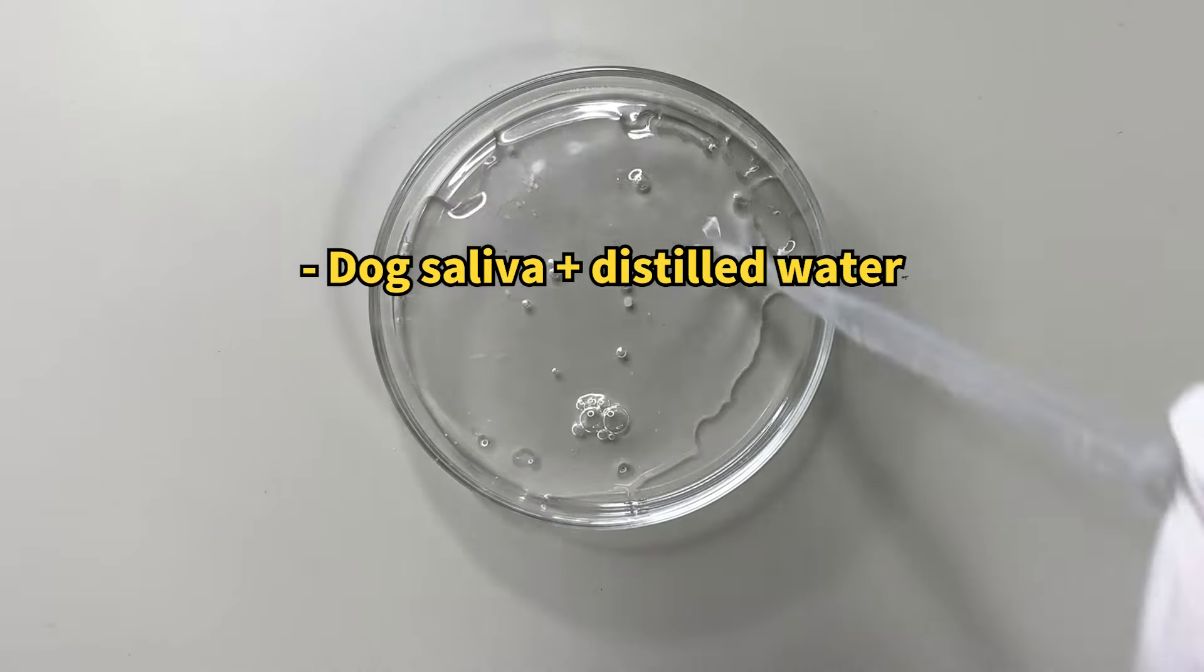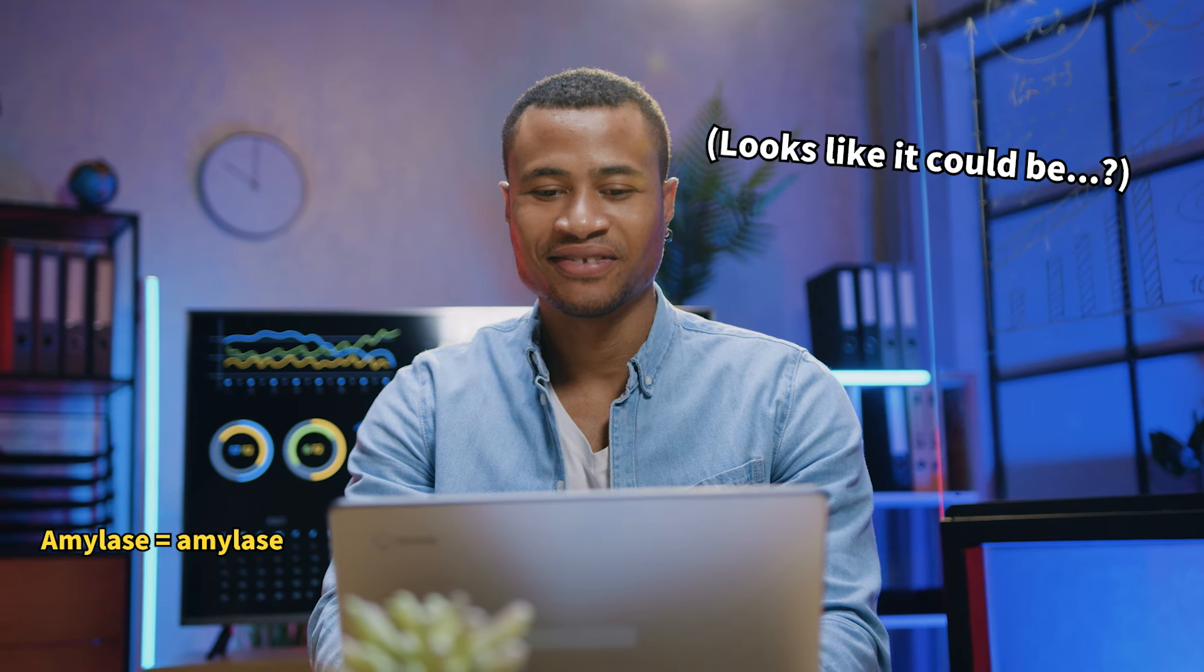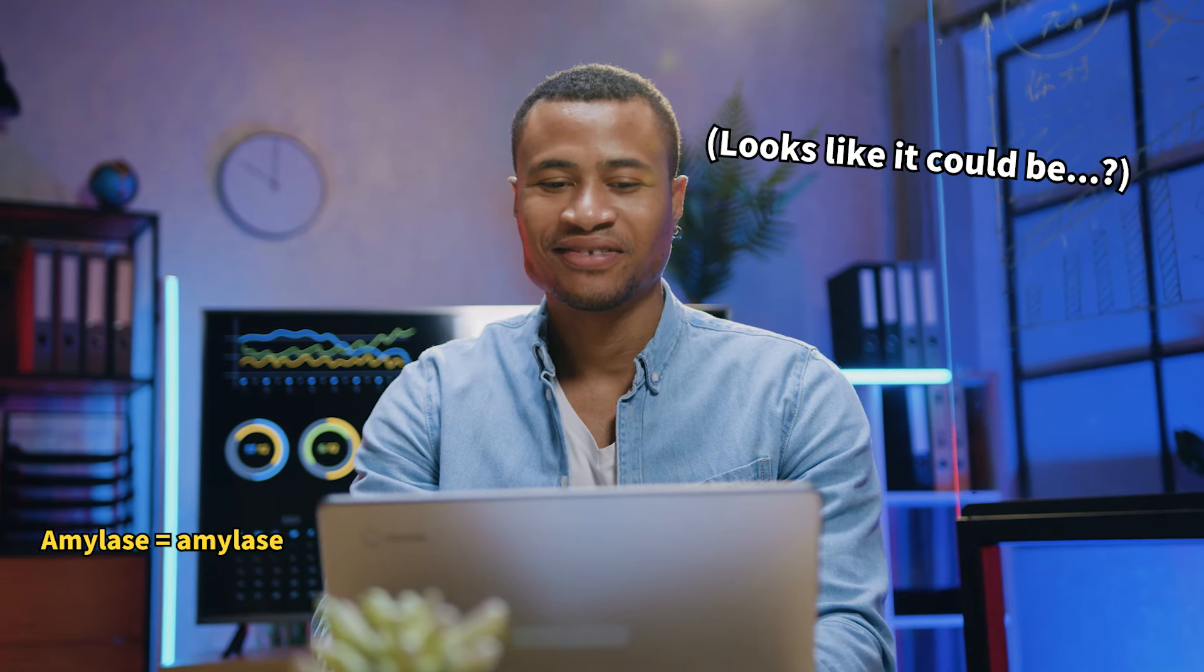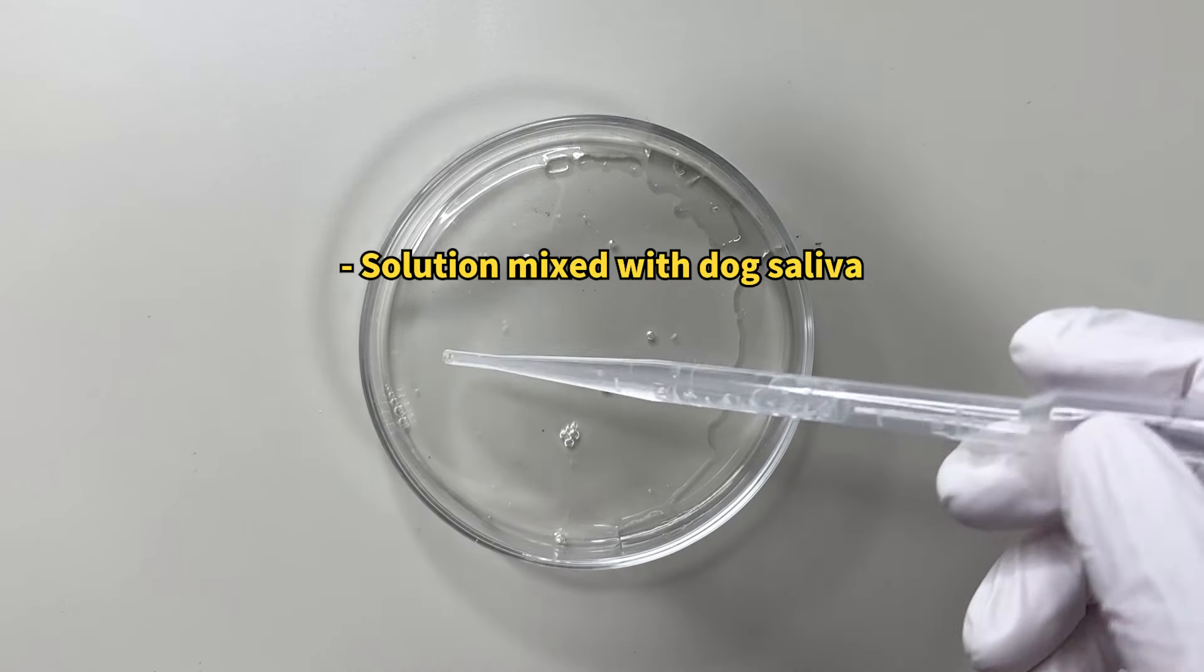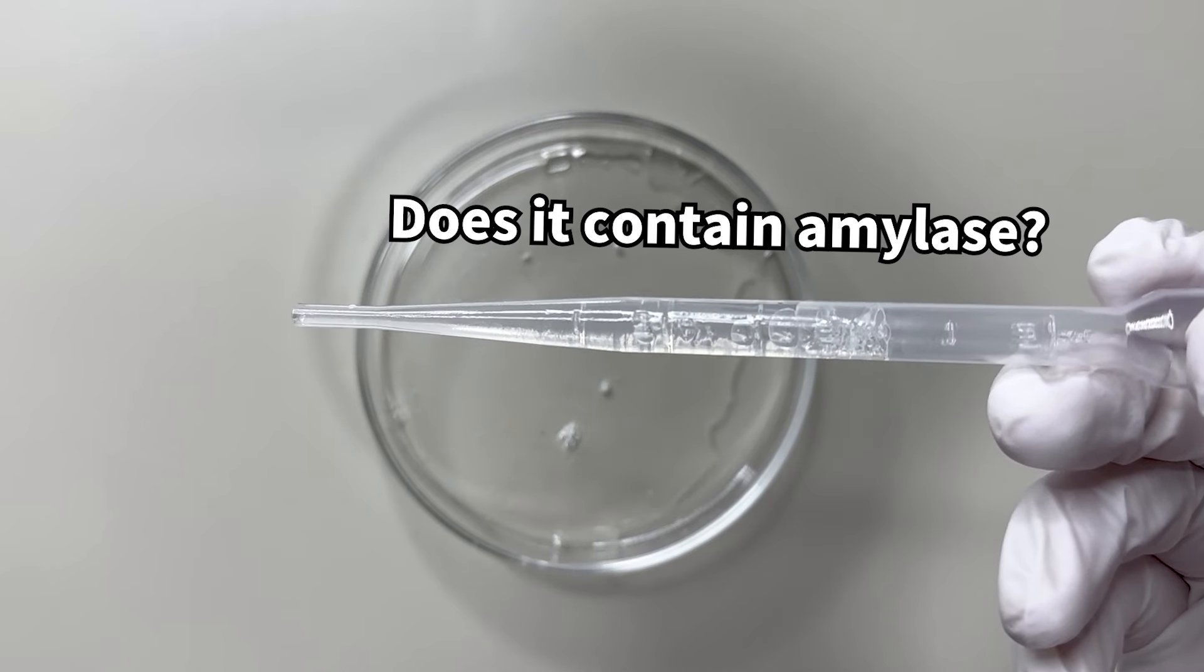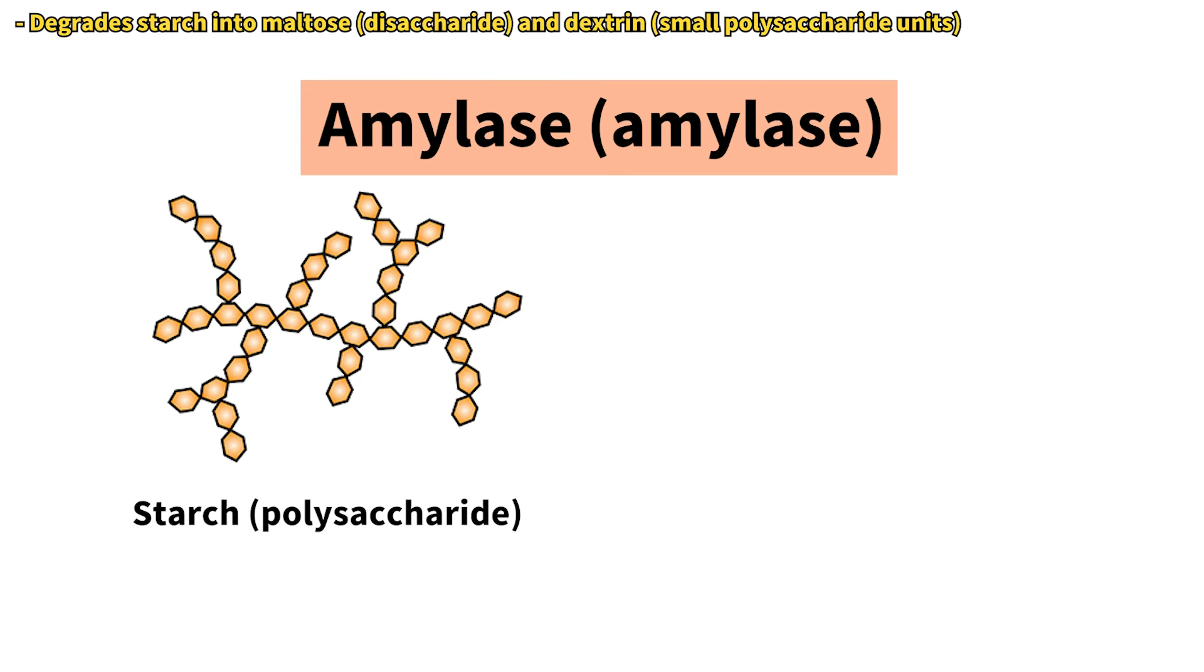I decided to collect his saliva after reading an article claiming that dog saliva contains no amylase. To test this, we explored the properties of amylase. Amylase is a digestive enzyme that breaks down starch, a complex carbohydrate, into simpler sugars like maltose.